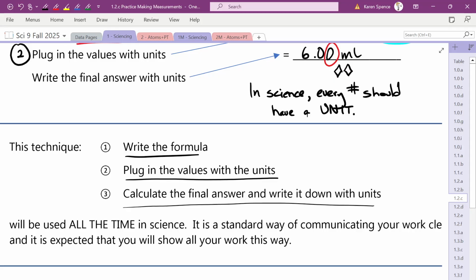Do you put the black line behind the meniscus or below the meniscus? Below the meniscus, okay? So it goes below the meniscus. Optional, you do not need to use this if you find it too complicated. So let's get this to you. Read the instructions carefully. If you have any questions, please ask.